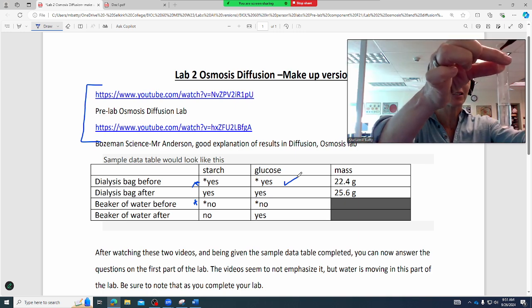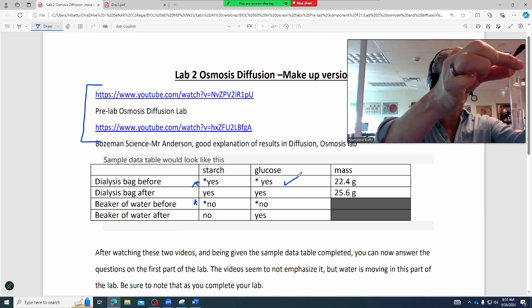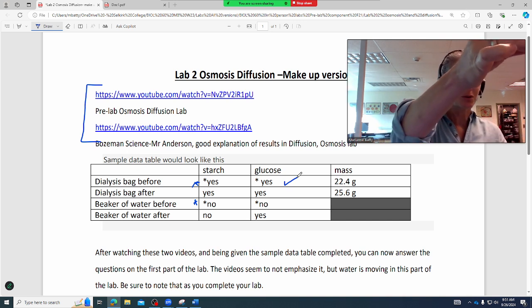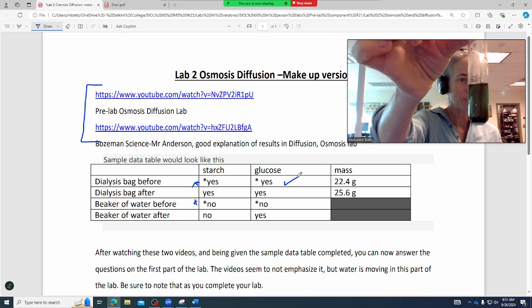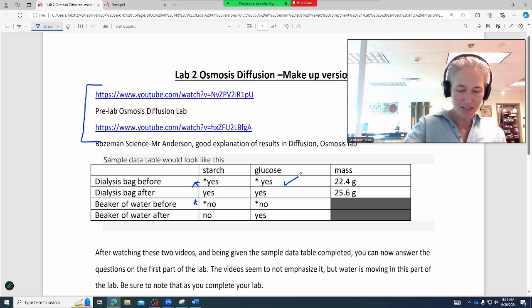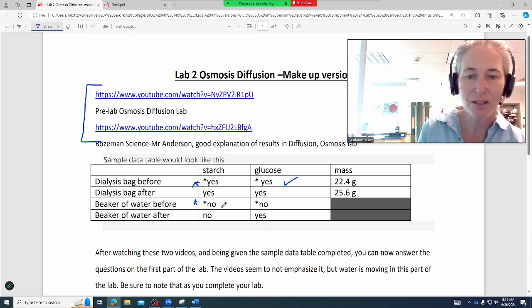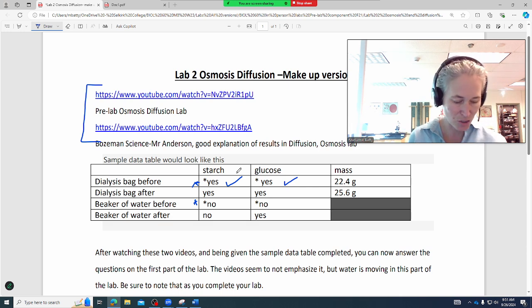And so I have the test tube here. I'm putting this brown liquid in, the Lugol's in, and it should go inky blue-black. So that one, oh yeah, there it goes. So it's got a very black color to it now. It's actually got almost a bit of a greenish tinge to it. And so that's a positive test for the Lugol solution. So the result here is that, yes, there is starch in the dialysis tube before.